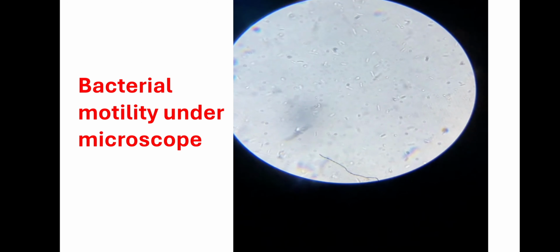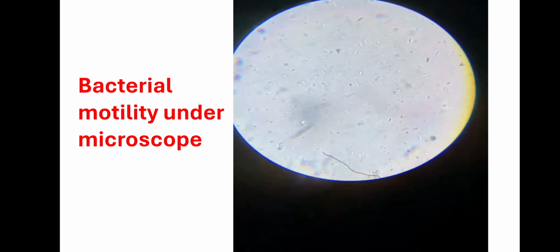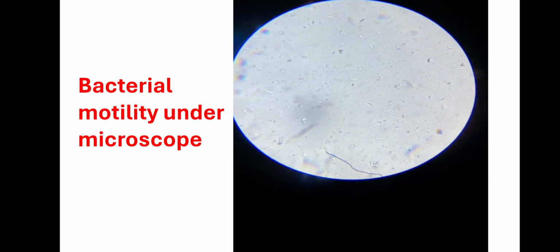Once again, look at this video where you can see that the bacteria are moving. So the conclusion will be: the given bacterial suspension is motile.